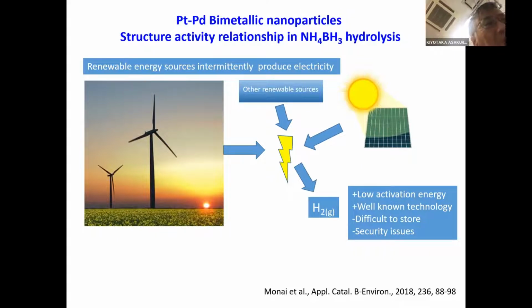Okay, what we do at this moment, we use an approximation. It's quite good. It's by design very linear. I see. We changed our crystal bender recently for a graded version, and now we use a sinus arm.